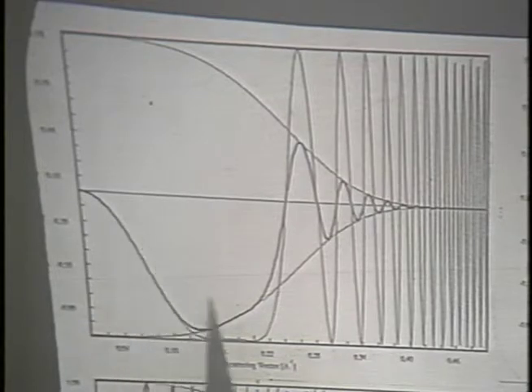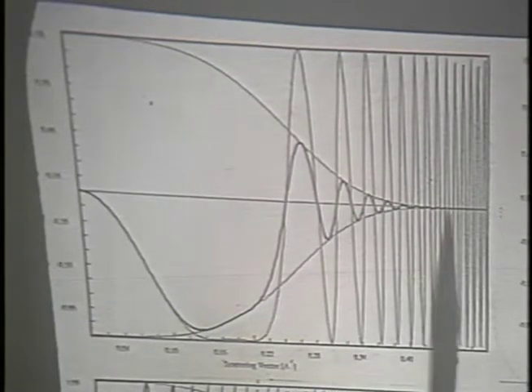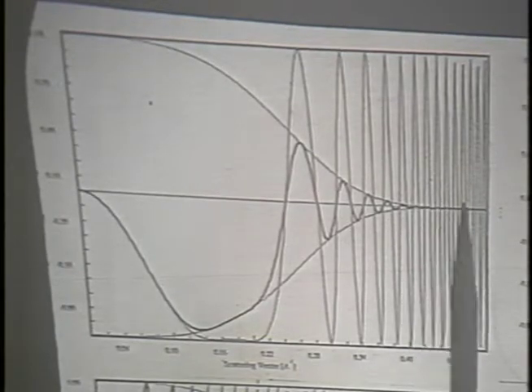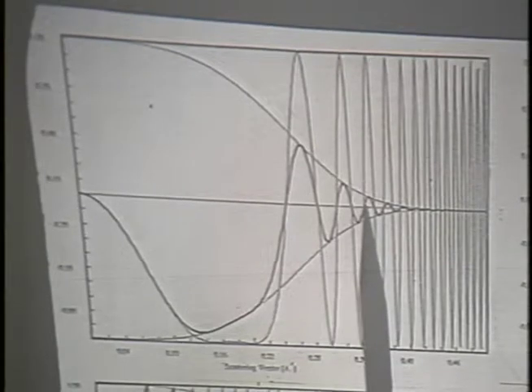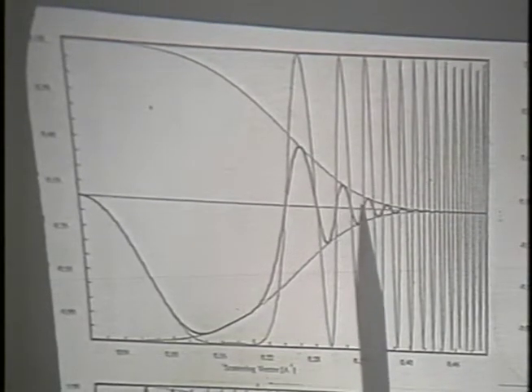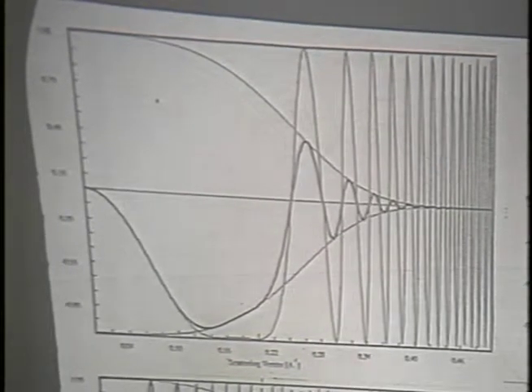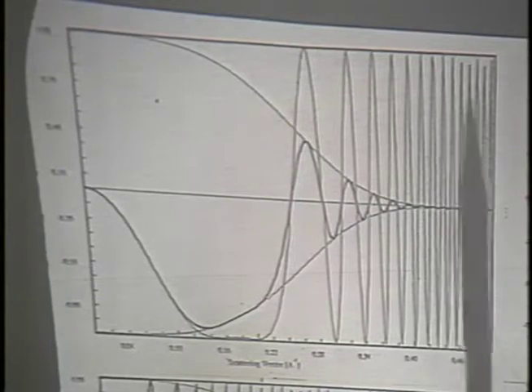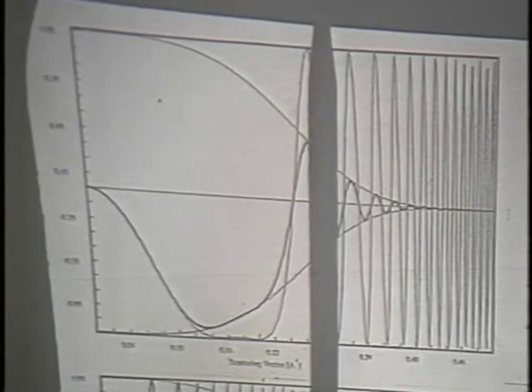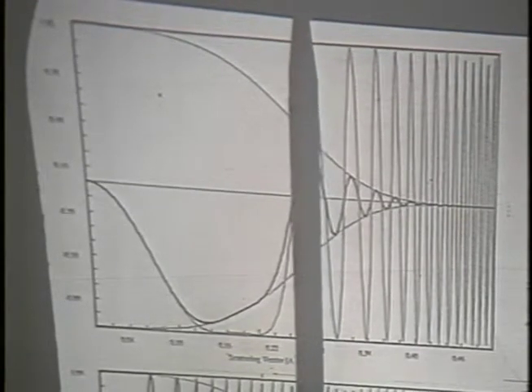And as you see, as you go to higher resolution, the oscillations in that function become more and more rapid. Basically, what this means is that at high resolution, the contrast becomes too complicated to interpret easily. It's not impossible to interpret, but it's far too complicated to interpret just by looking at a micrograph. And so one normally truncates the resolution in the visual interpretation of the image at about the first 0 in this sine function.